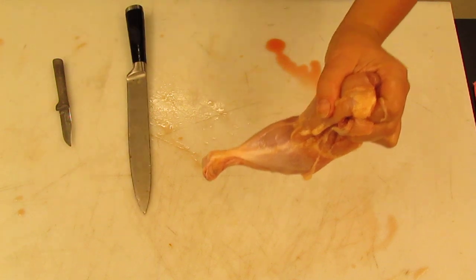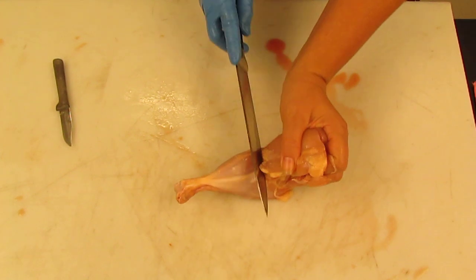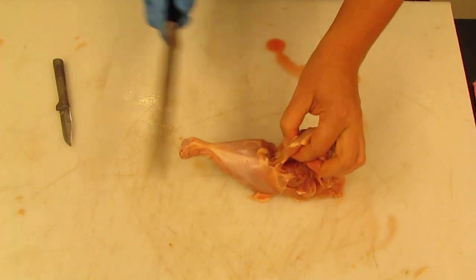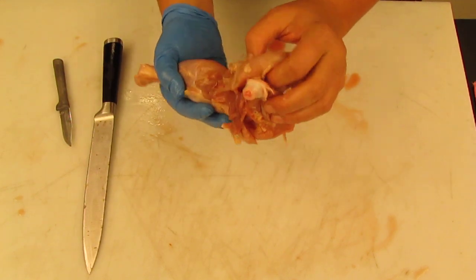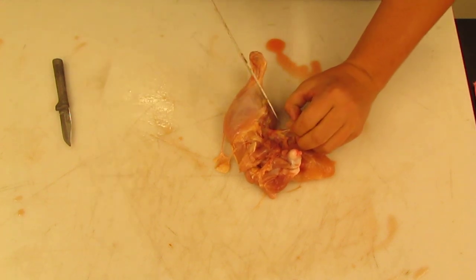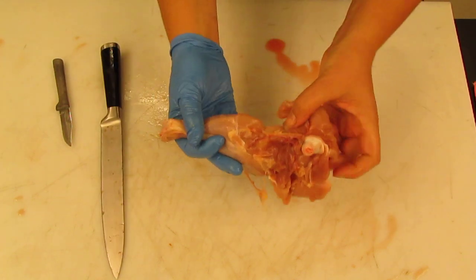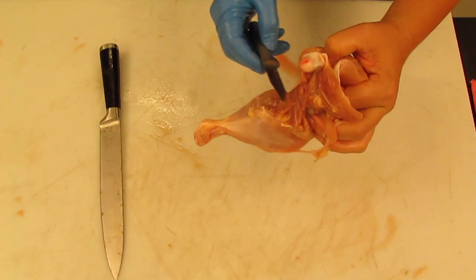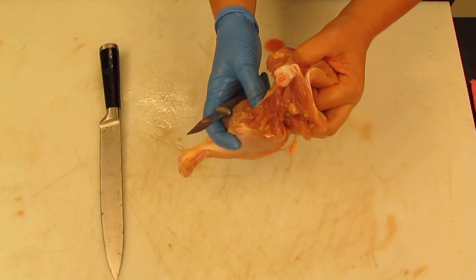All right, not too far. I don't want to cut all the way through the joint. I just want to get some of the muscle out from around the joint. So nice and gentle. Removing some of this extra muscle. And so, what I have now is more exposed nerves and blood vessels, and I can just barely start to feel the joint, the bones themselves.